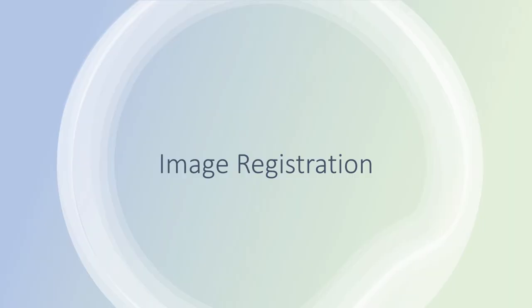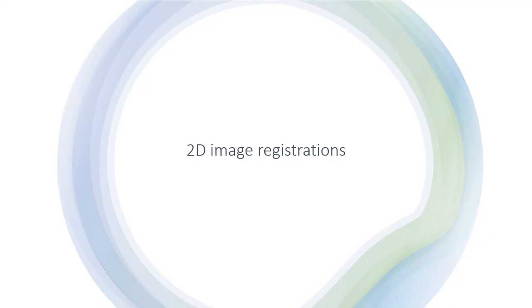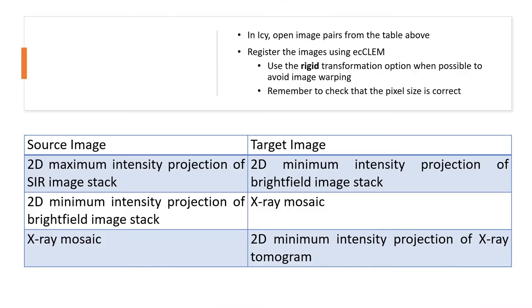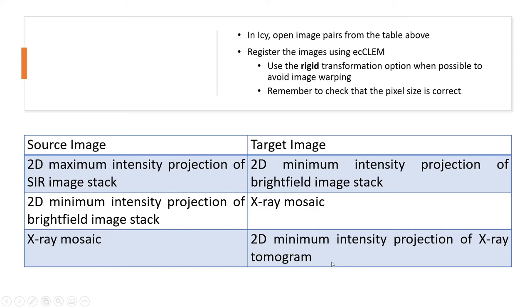So now onto the image registration. We'll first do a series of 2D image registrations. We'll take the 2D images that we've just generated. The first one we'll do is this pair here: the SIM image with the brightfield image. Then we'll do the brightfield and the X-ray mosaic. And finally the X-ray mosaic and the tomogram.